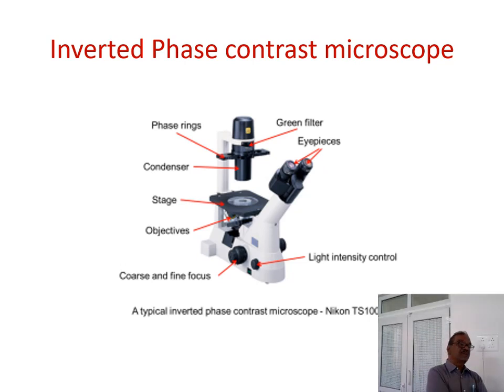Why are we calling it an inverted microscope? Yes, the stage. Where is the stage? Here you can see the stage.